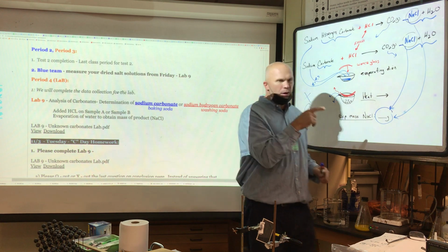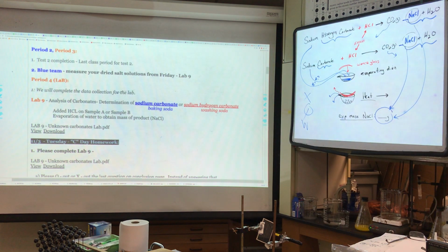But one thing that's kind of cool is, and I don't know if we're going to get there because we're going to heat pretty violently, but if it heats slowly, you get these beautiful crystals. Okay, I want to show you the crystals that we do get sometimes. And here's an example of sodium chloride crystals that are recovered in the reaction. I'll put this on the big screen here.